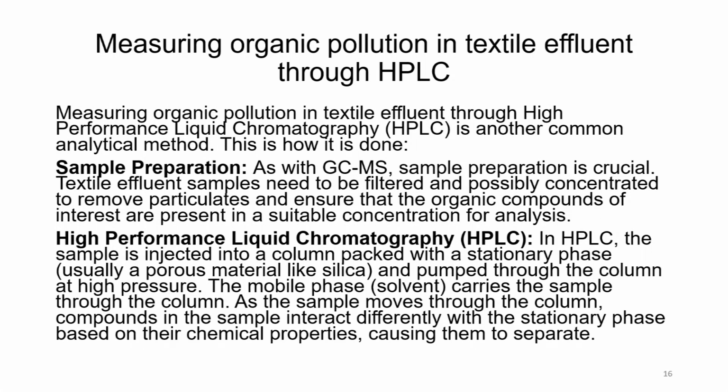How are organic pollutants analyzed on HPLC? We just now saw how they were analyzed on GCMS. Measuring organic pollutants in textile effluent through high performance liquid chromatography, that is HPLC, is another common analytical method, and this is how it is done.